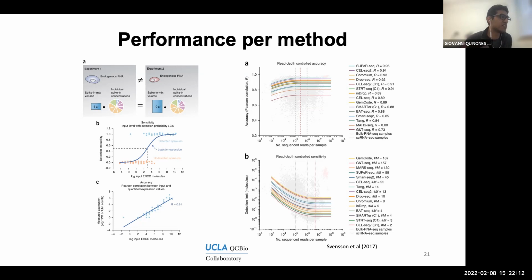So you already have an expectation of how much expression you expect at the end. So this is your benchmark, and you can use spike-ins to test pretty much any type of RNA sequencing library preparation, well, not any, but a lot of protocols related to RNA. And so you have these known concentrations of RNA.